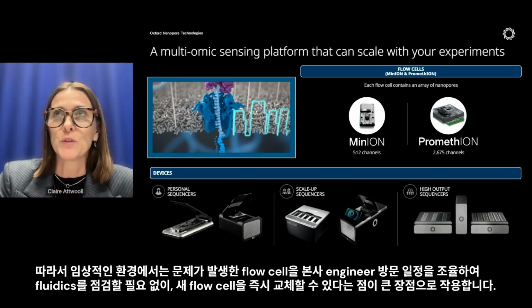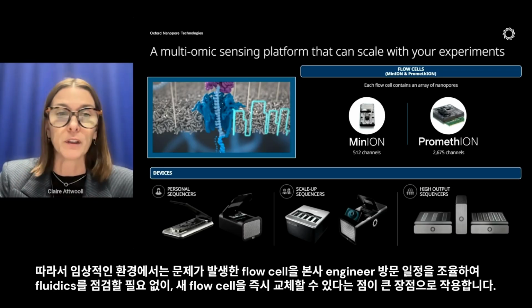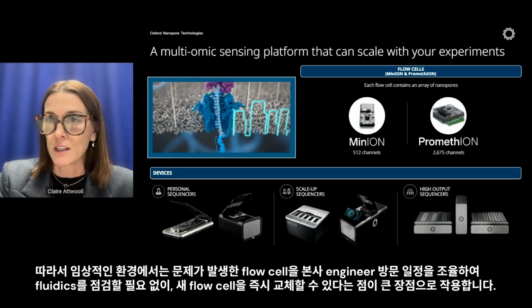As we move towards more clinically focused markets, the ability to swap out a faulty flow cell, for example, with a new flow cell, rather than having to wait for an engineer to come and look at fluidics, is quite attractive.